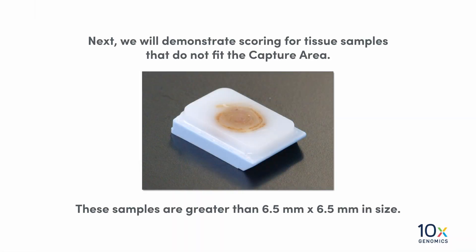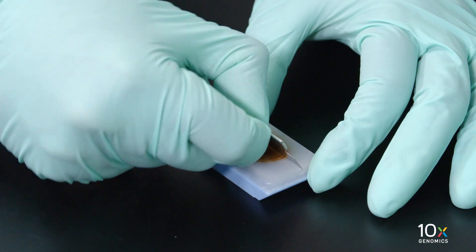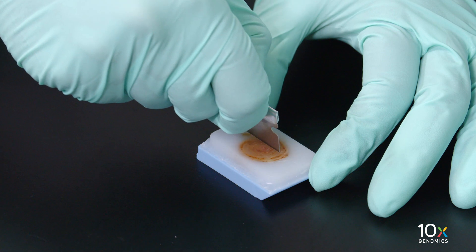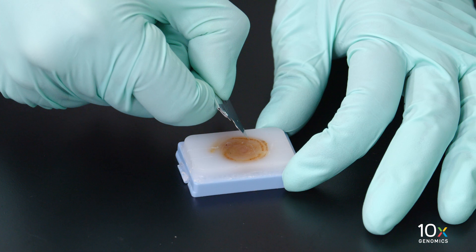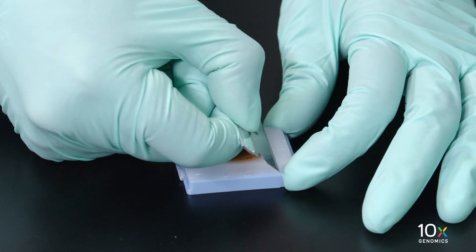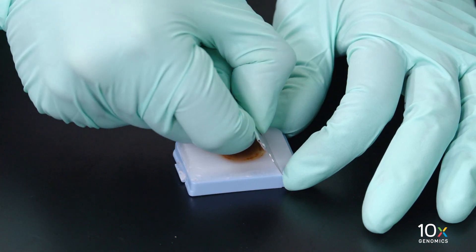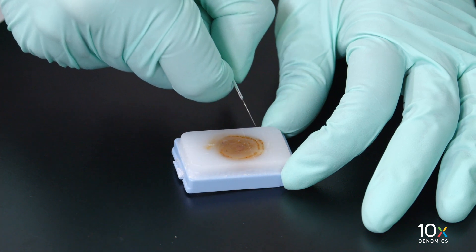Next, we will demonstrate scoring for tissue samples that do not fit the capture area. These samples are greater than 6.5 millimeters by 6.5 millimeters in size. In order to generate a smaller sample, we can score the tissue block with a razor blade. Remove the tissue block from the microtome and glide a razor blade over the surface of the tissue to introduce a shallow cut. The incision should be shallow — a deep incision may lead to tissue damage and disintegration.